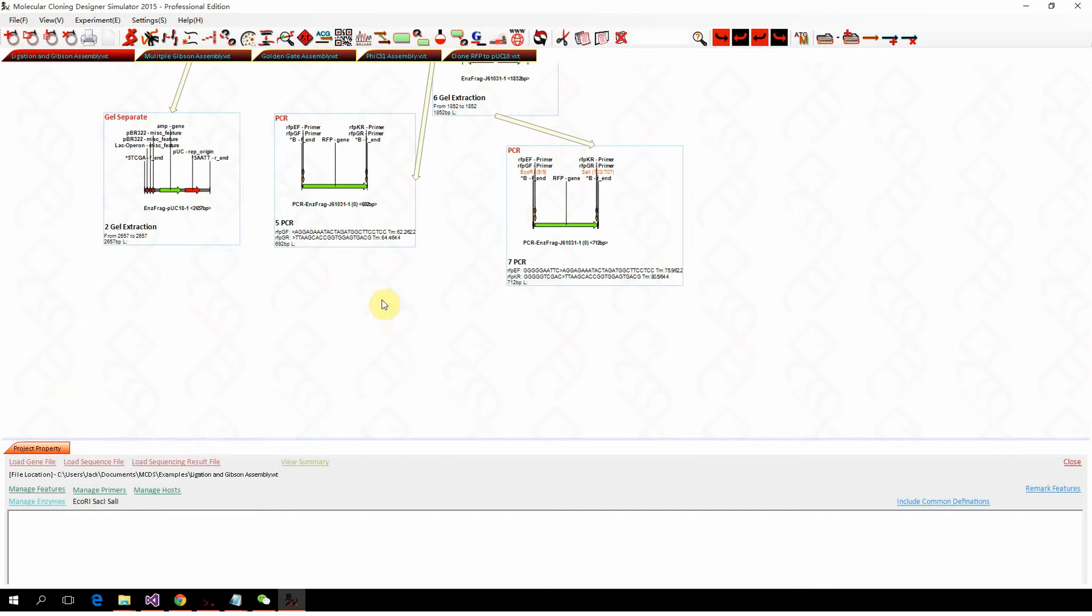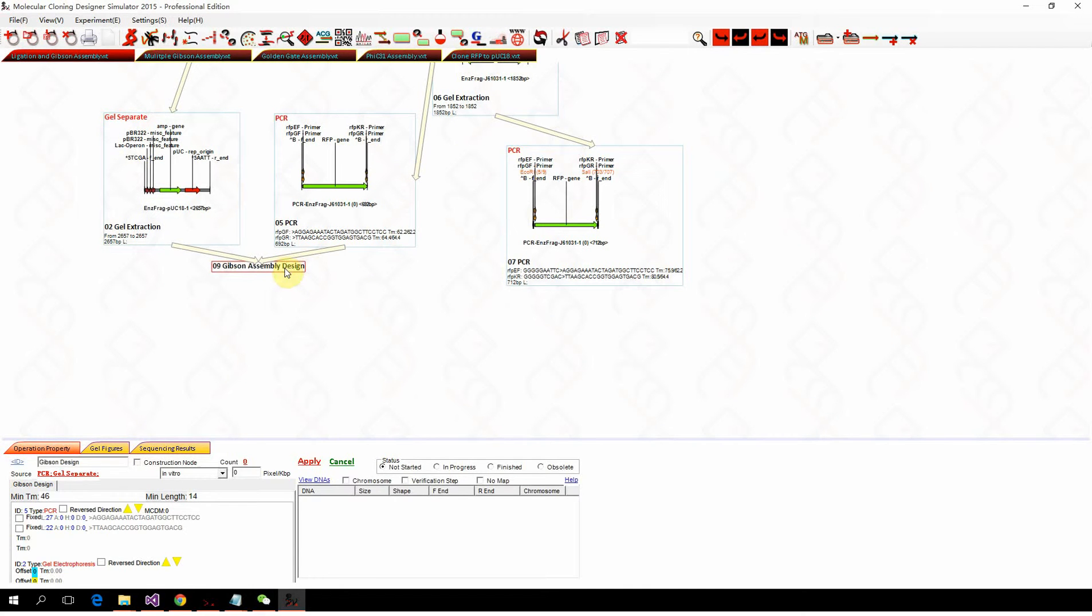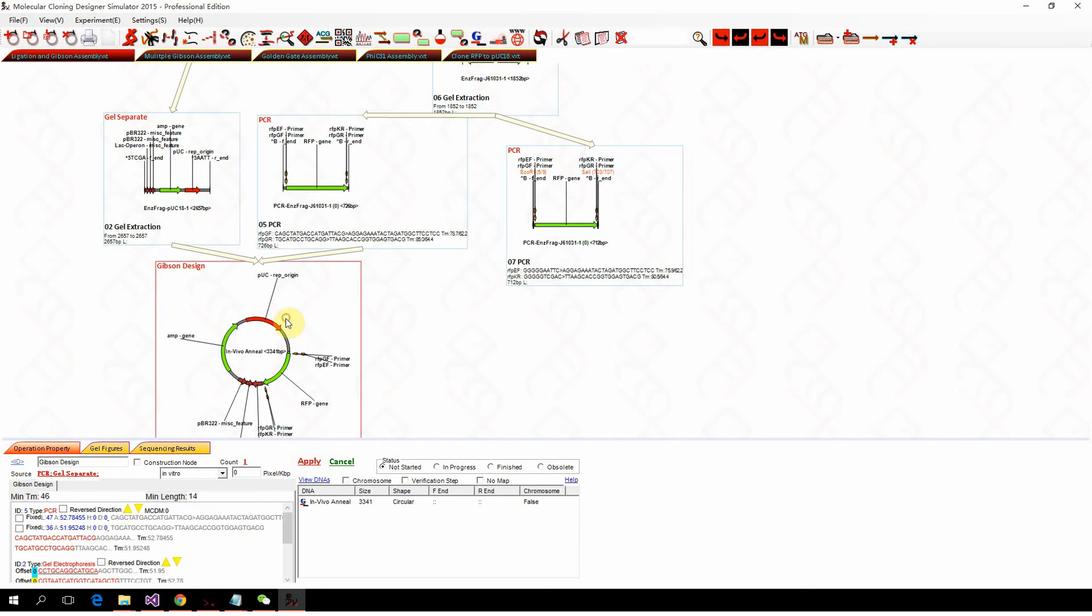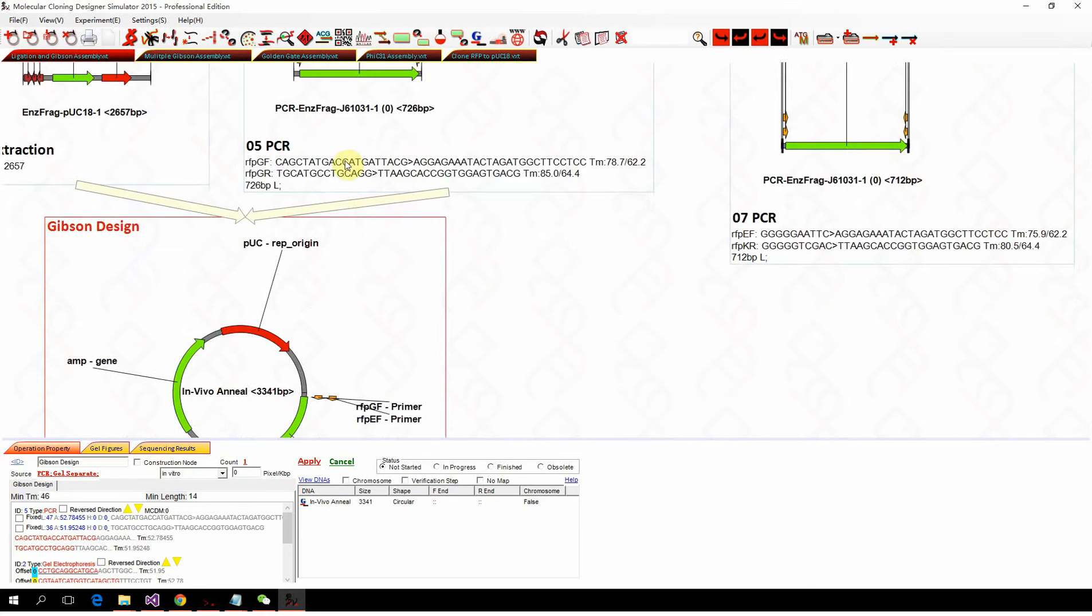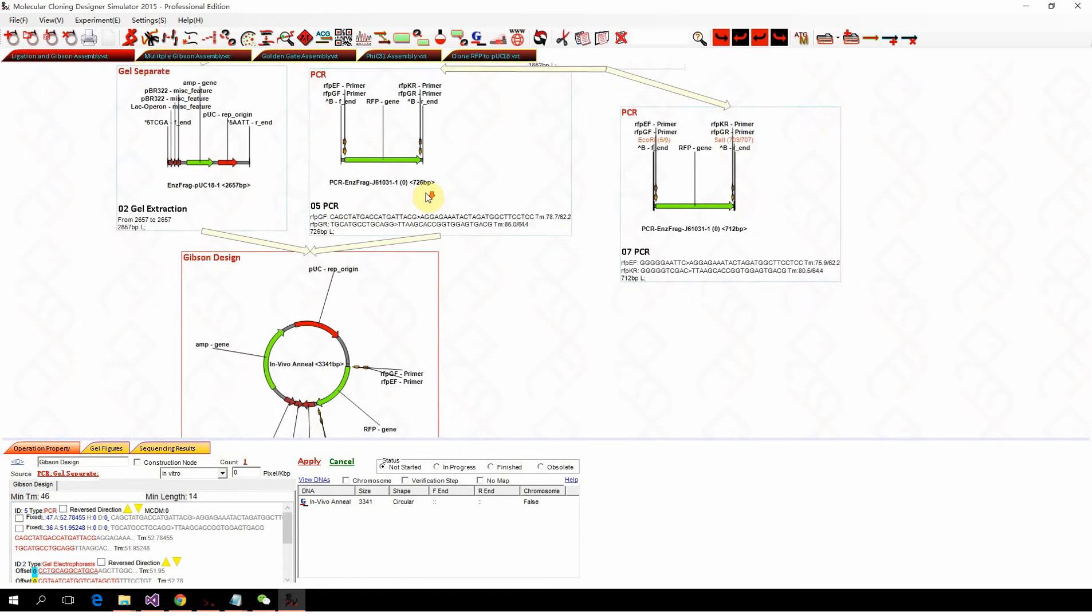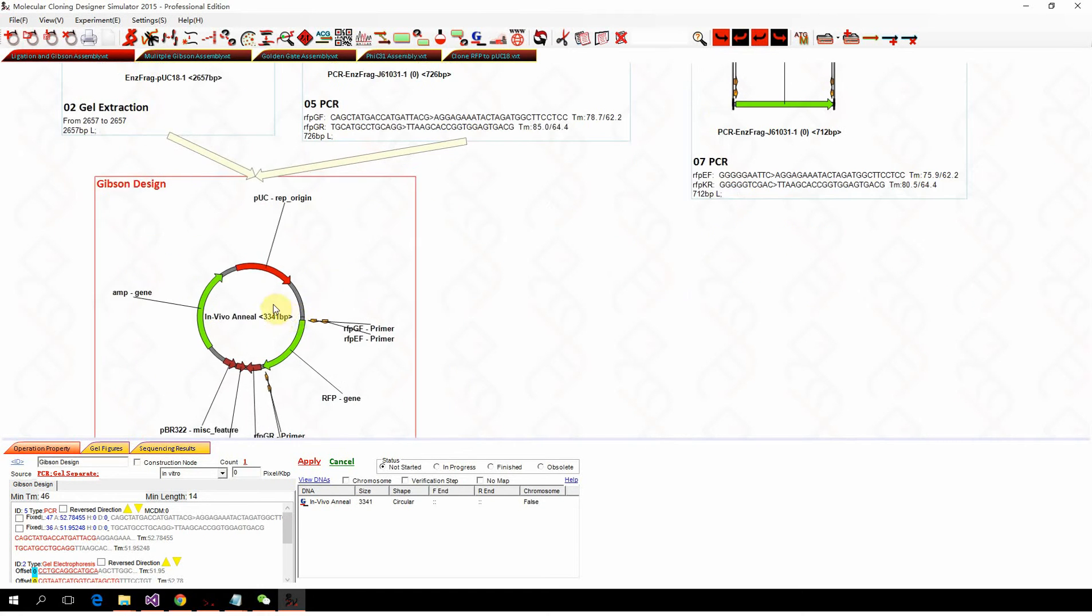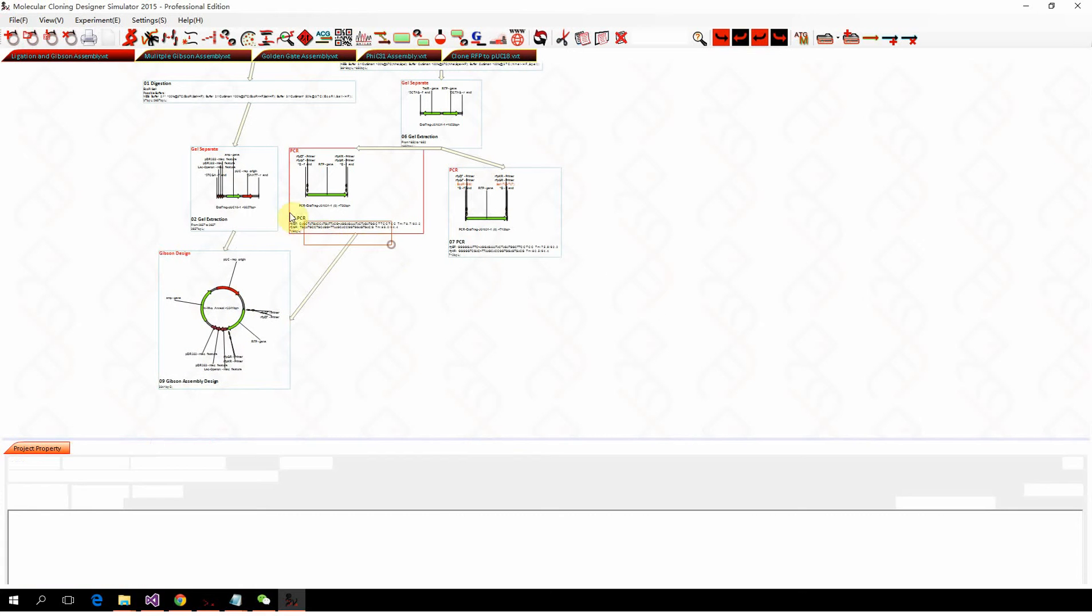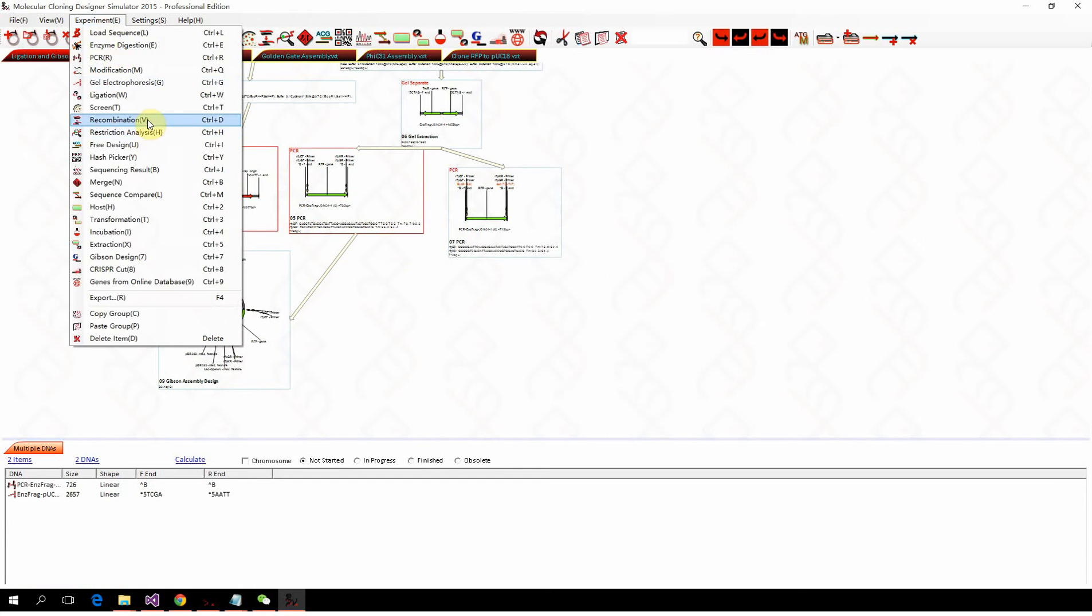We simply select both two fragments and click Gibson design. With just one simple click and apply, the Gibson design will attach the annealing sequence to both primers. Gibson assembly is actually identical to recombination.